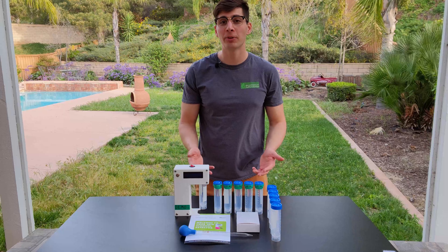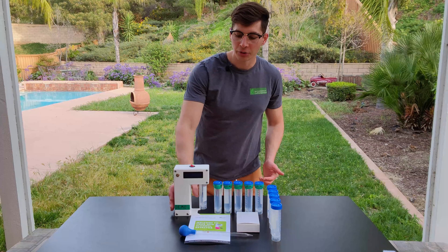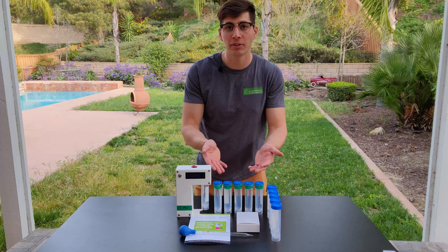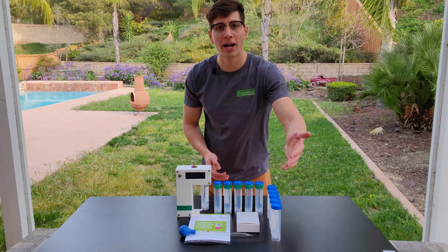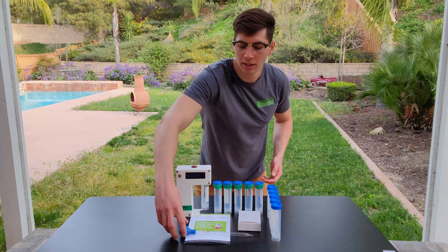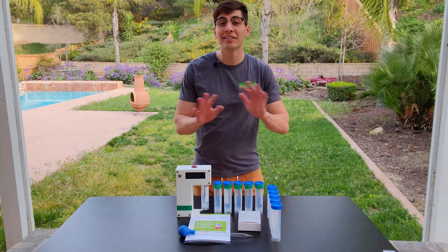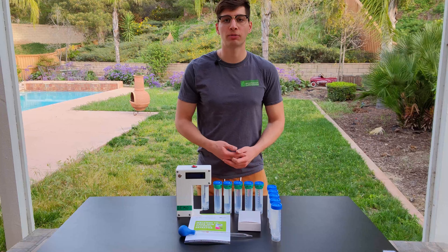Everything that you see here is included with your purchase, as well as a one-year warranty and customer service. We have an alcohol content detector, five alcohol content standards to get you started with calibration, five empty sample tubes to measure your alcohol samples, a power supply, a glass pipette for you to measure future alcohol content standards, as well as an instruction manual.